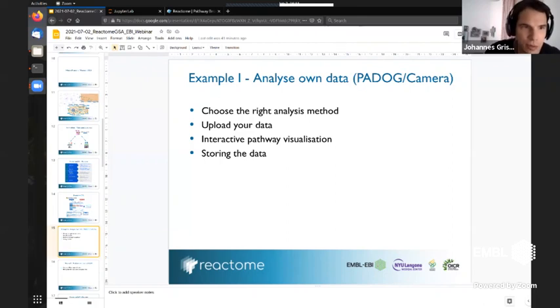Next one: what do you use for the analysis of RNAseq data, TPM, RPKM, or ReactomeGSA? This is kind of a mixed question. TPM and RPKM are normalization values, right? We recommend you upload your raw counts, the actual raw gene-level read counts per gene, because this allows us to have more accurate statistics. If you only have TPM or RPKM, we support them as well through the RNAseq normalized option, but the recommended one is raw counts.